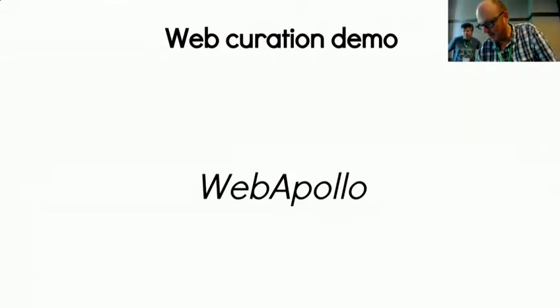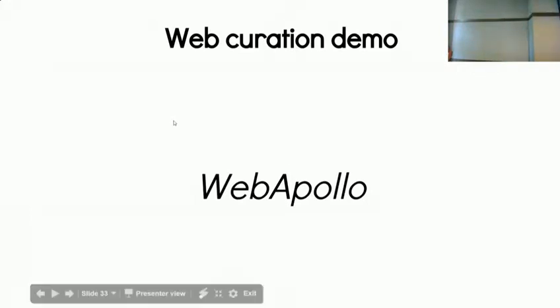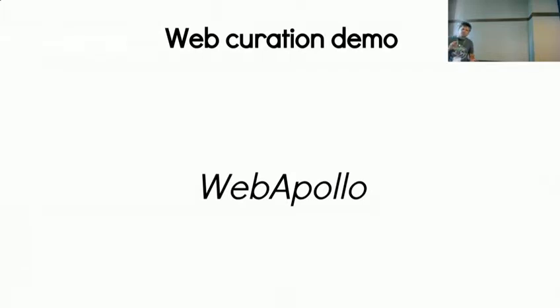And just before you go on, the Galaxy community in general is working on a way of having, so we've got JBrowse in Galaxy at the moment, and a few of them are working on making Web Apollo available as a Galaxy plugin as well. Yeah, and I'll show a little bit of this, and I think we're going to do a talk and a poster about it as well.